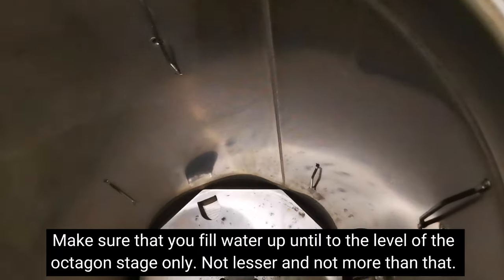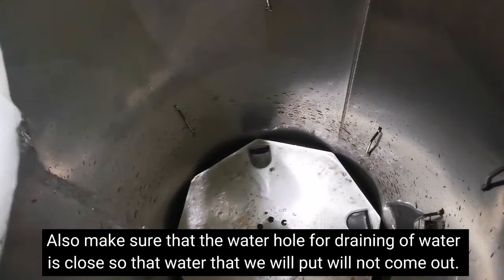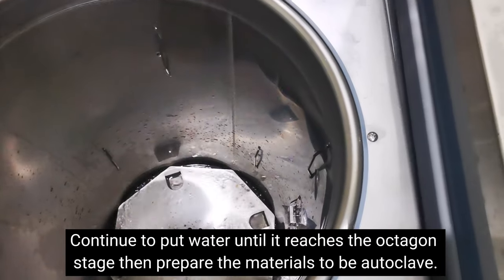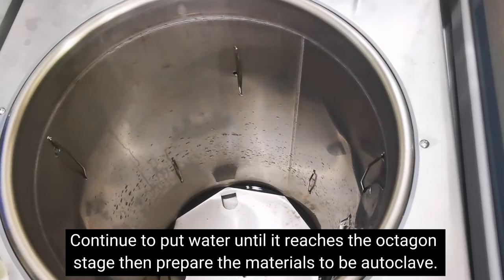Pour water inside until it reaches up to the octagonal stage. Make sure the drain hole at the bottom of the autoclave is closed — we use that hole to drain the water after each use. Make sure it's closed before adding water. Now the water level is good — it's level with the stage. Let's prepare our materials.